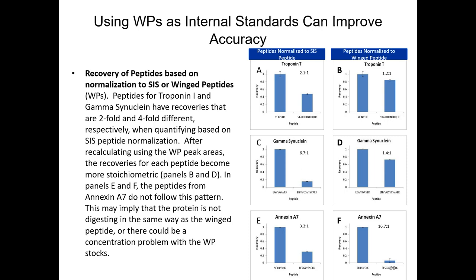And then this is what you would normally see, taking that same light peak area from the protein and dividing it by the tryptic synthetic peptide. So this isn't accurate by any stretch of the imagination. And we normalized the responses to the 1 protein from each set so that we could just get a better apples-to-apples comparison.